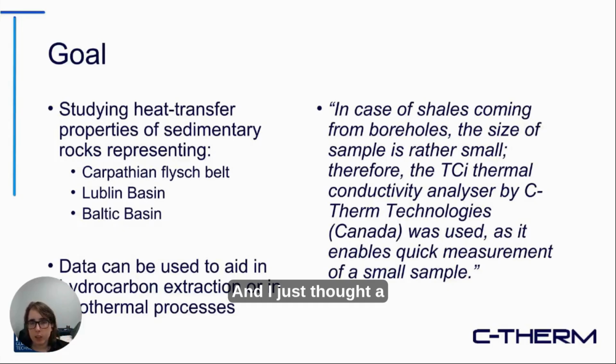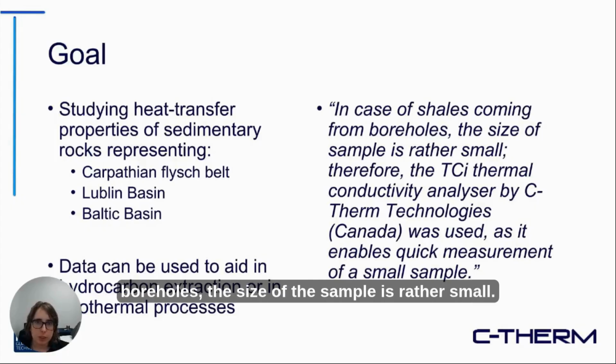And I just thought a nice quote to take out of the paper was, in the case of shales coming from boreholes, the size of the sample is rather small. Therefore, the TCI thermal conductivity analyzer by C-Therm Technologies in Canada was used, as it enables quick measurement of a small sample.